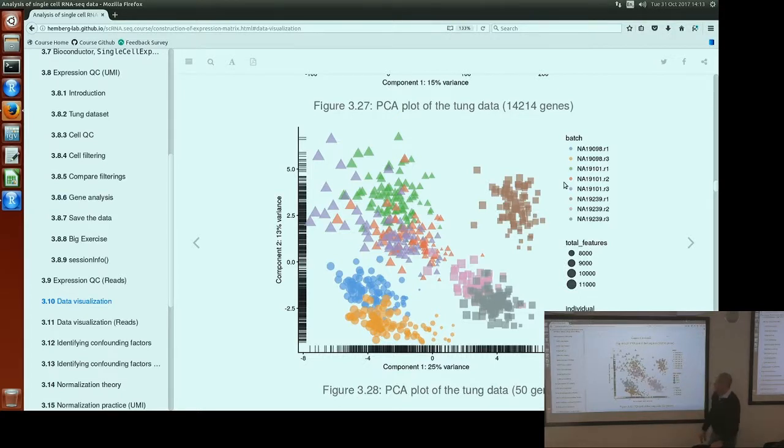So here we can see a bit more biology instead of total features effect, which is not surprising because we use fewer genes. So the noise and the variance in the total features is less because we have fewer genes.